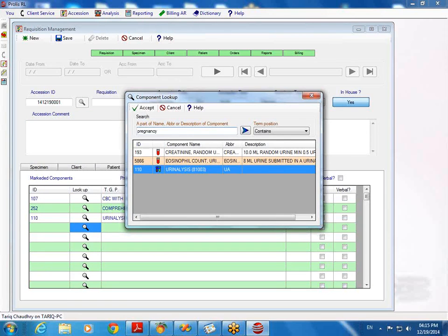Could you have multiple tests run on a single sample? For example, if we receive tissue that we want to do, let's say a microarray test on and a PCR test on, could we change the status of that sample or at least have it recorded for both? Yes, you could do on single source, it provides you the capability to order multiple tests on it. Yes.